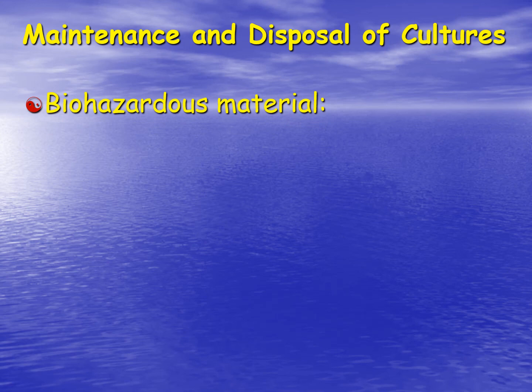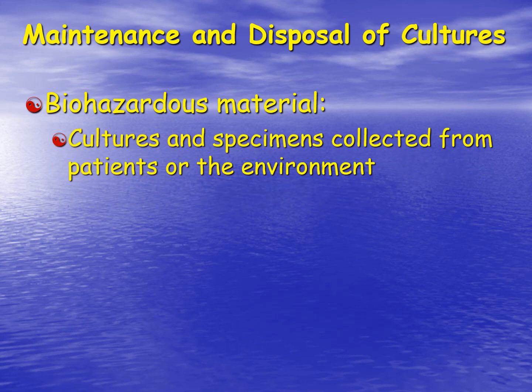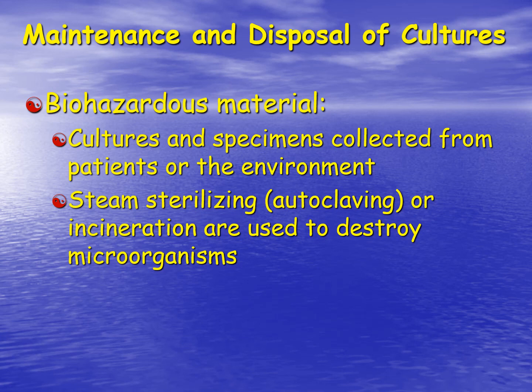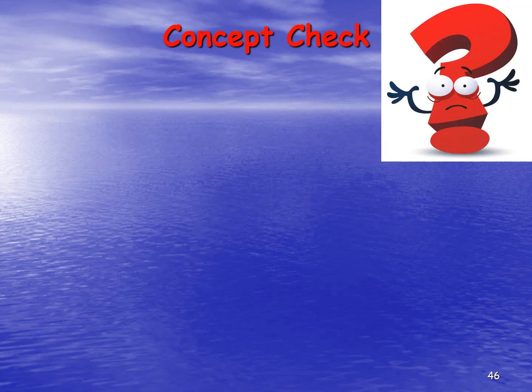Now, we are working with biohazardous material. While the microbes we work with in the laboratory are not exactly extremely pathogenic, they can be. So here's a rule of thumb for the lab. Do not lick the E. coli plate. Okay? Just don't do it. Cultures and specimens collected from patients or environments that are grown become biohazardous. Steam sterilizing or autoclaving or incineration are used to destroy microbes. This will get rid of everything that could potentially cause disease.